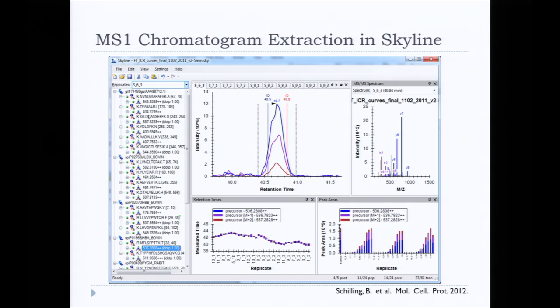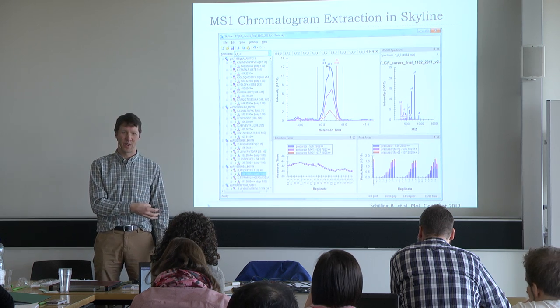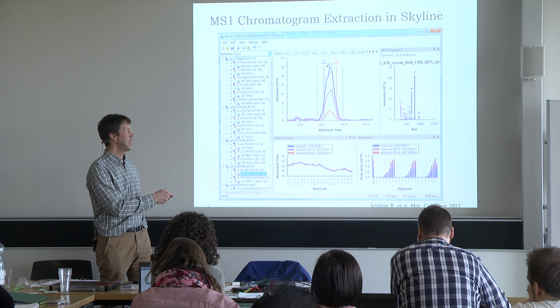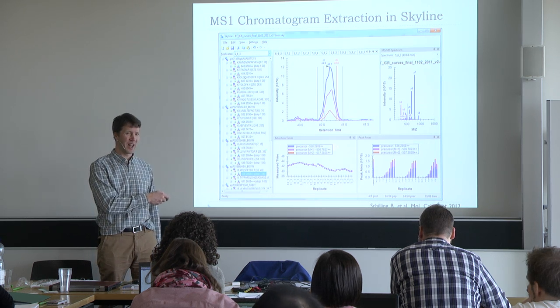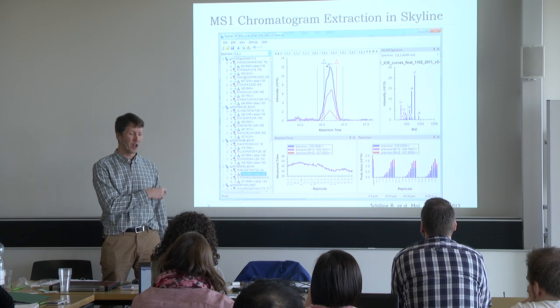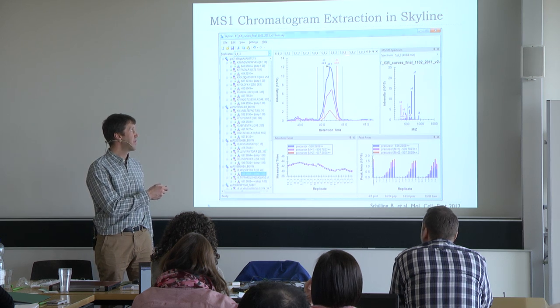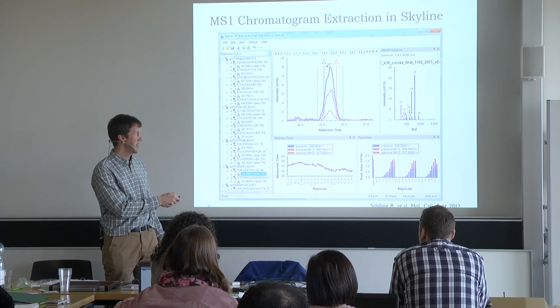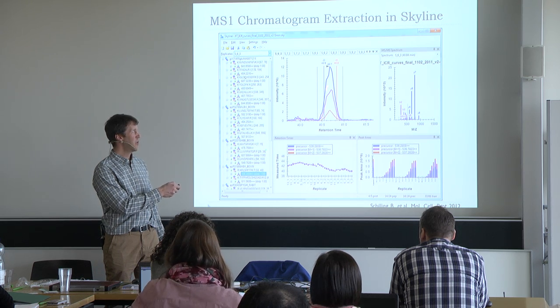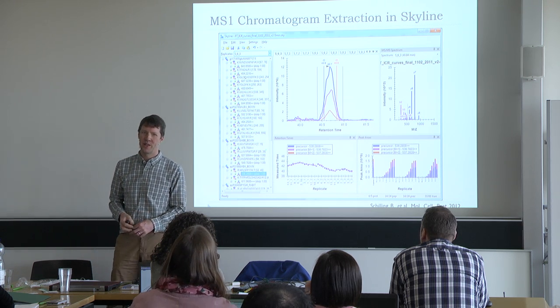And this actually kind of highlights one of the issues with spectrum-based quantification. If we were trying to quantify based on the spectra coming out of here using an iTRAQ method or a TMT method, we have very little control of where these MS spectra get collected, and so the best place for us to be quantifying on is at the peak, or even taking a chromatogram area that goes across the entire set of scans. But frequently, if we get these spectra, we have no control. They can be collected right at the beginning here, or in this case on either side. So who can tell me what kind of experiment this was?